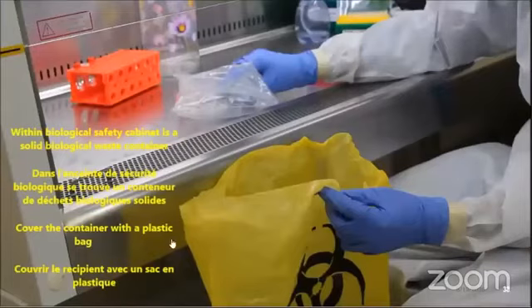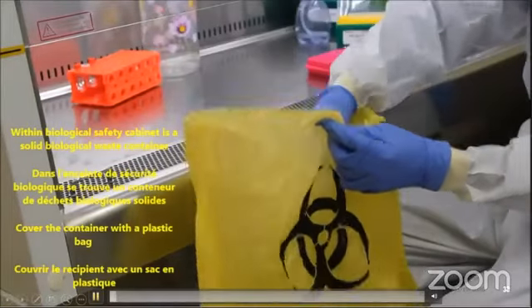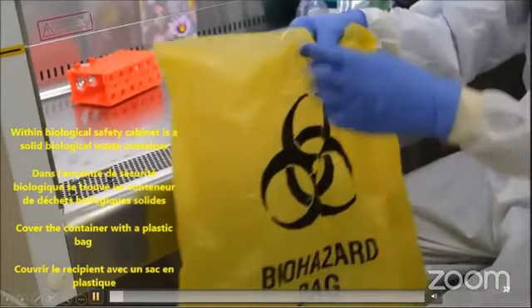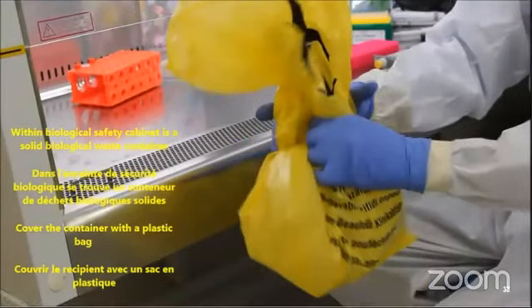So this is the spill of our sample, and now we have to discard the sample properly in the biohazard bag. So what procedure do we have to use? Now take out the small biohazard bag from the safety cabinet and put it into a large biohazard bag.